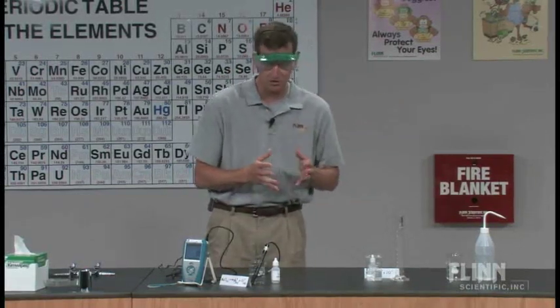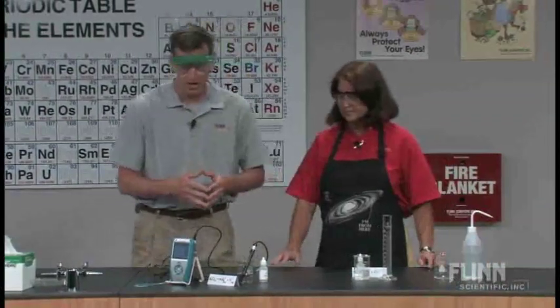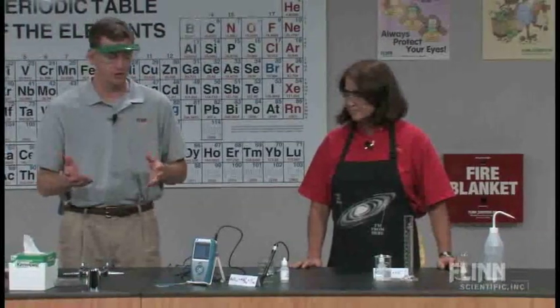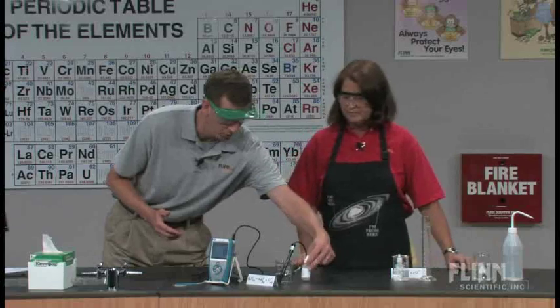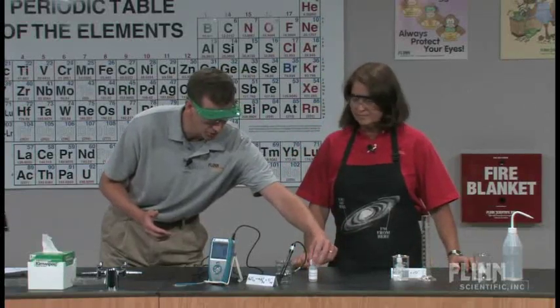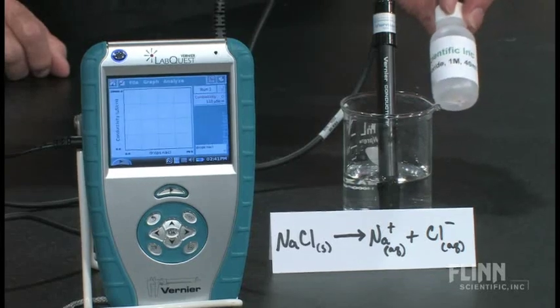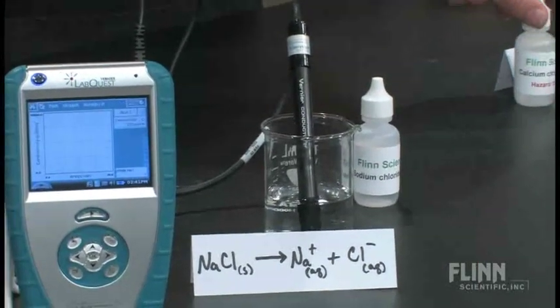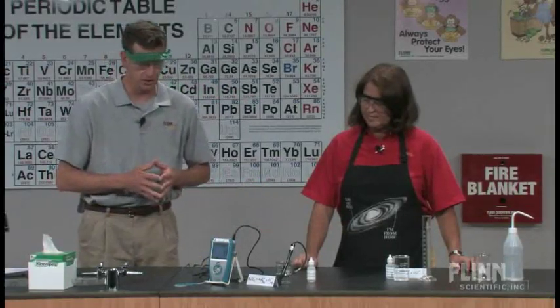I'm going to have Penny help me here today because this really needs to be done in a two-person laboratory setting. I'll be the one running the LabQuest, collecting data as we go, and Penny's going to be helping us by dropping drops of one molar sodium chloride and one molar calcium chloride solutions. We're going to be dropping those into 70 milliliters of distilled water.